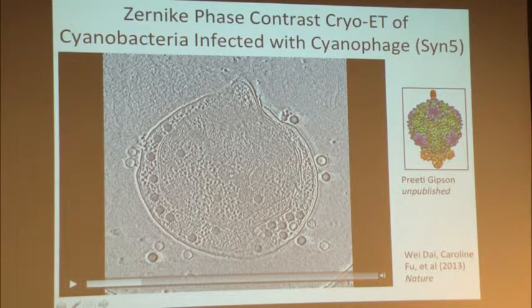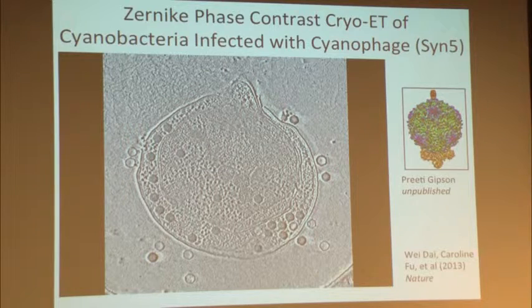This is about a 1,000 angstrom round thing, and it's interpreted as a carboxysome. Carboxysome is a particle that contains the carboxylase, which is an enzyme that fixes carbon dioxide in the dark reaction of photosynthesis. So carboxylase is the most abundant enzyme on Earth.